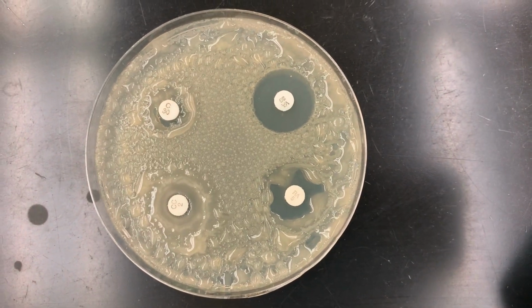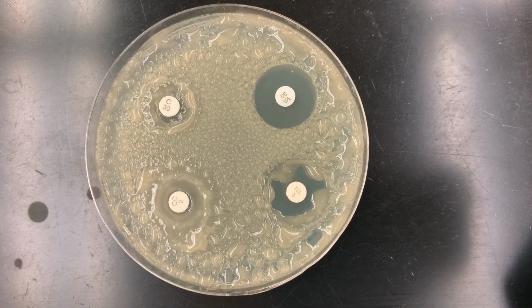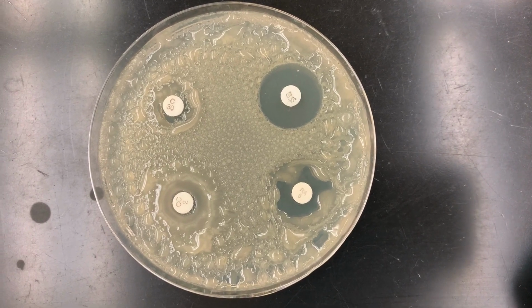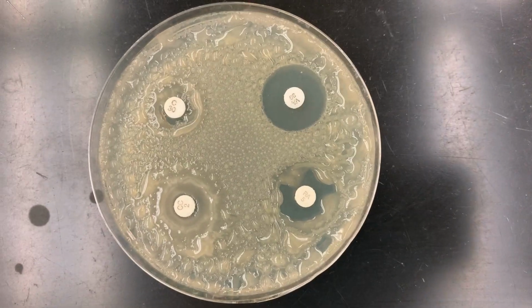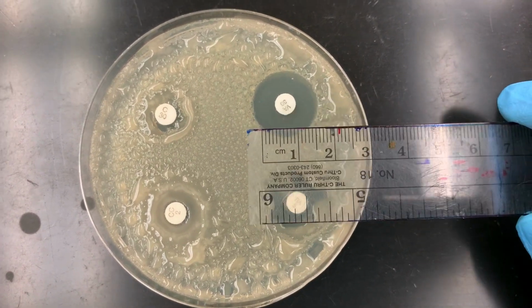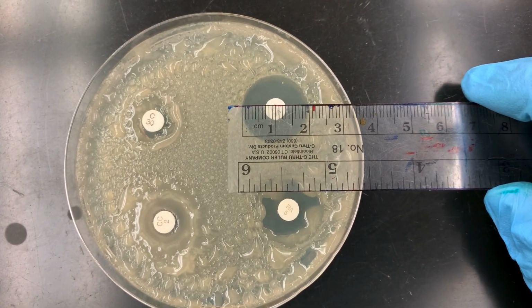Here is a final plate for you to interpret. As we can see, the 2 antibiotics on the left, the bacterium was completely resistant. C is going to be chloramphenicol. CC is clindamycin. VA is vancomycin, so you can interpret based on the table.